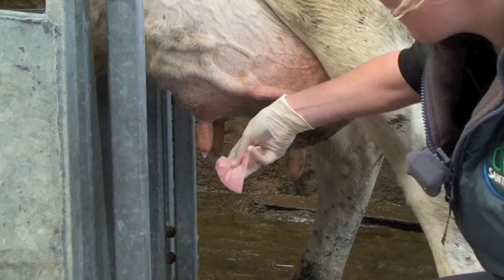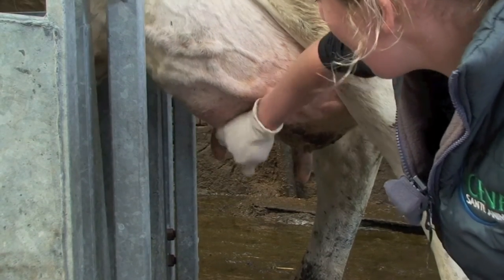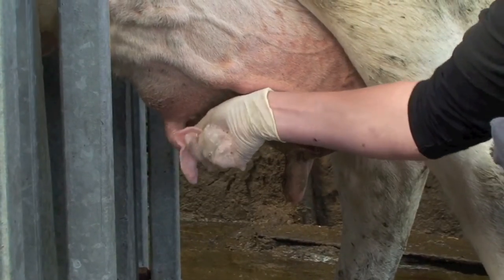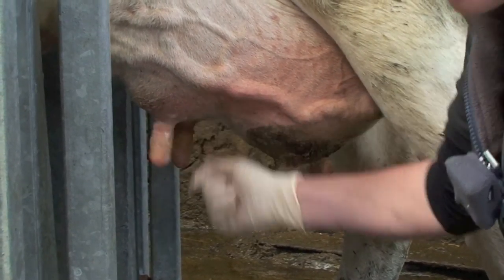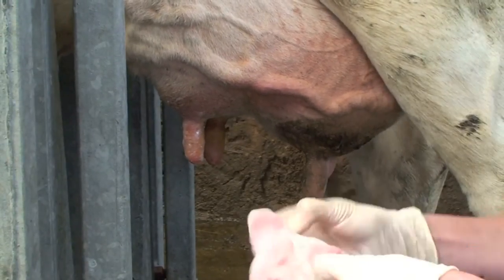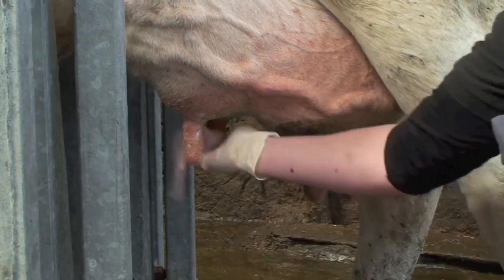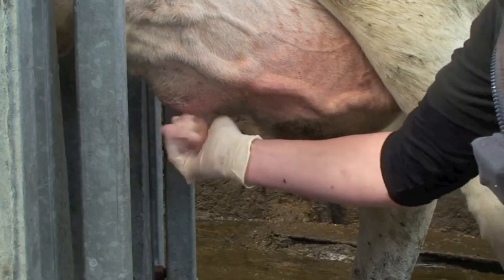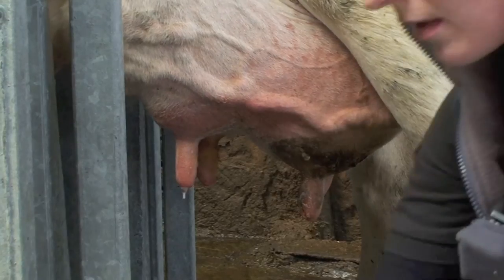We're going to use our swabs that are already soaked in the hibiscrub for cleaning up the teat, making sure we get the full length of the teat and also the teat end to remove all contamination. These swabs are still coming off dirty, which means we'll keep going until we've had at least one or two clean swabs to make sure there's no obvious dirt on there.